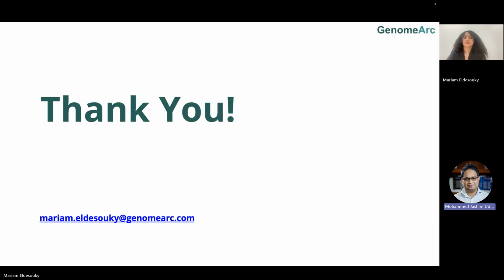Thank you, Mariam. Can the language model, Horizon Intelligence, predict disease and create gene panel to aid diagnosis? Can it also integrate this outcome with genomic data, especially the genome variant data? We just want to know from unstructured clinical data integrating with the VCF, can you design a panel and identify a variant of interest linking the phenotype with genotype?